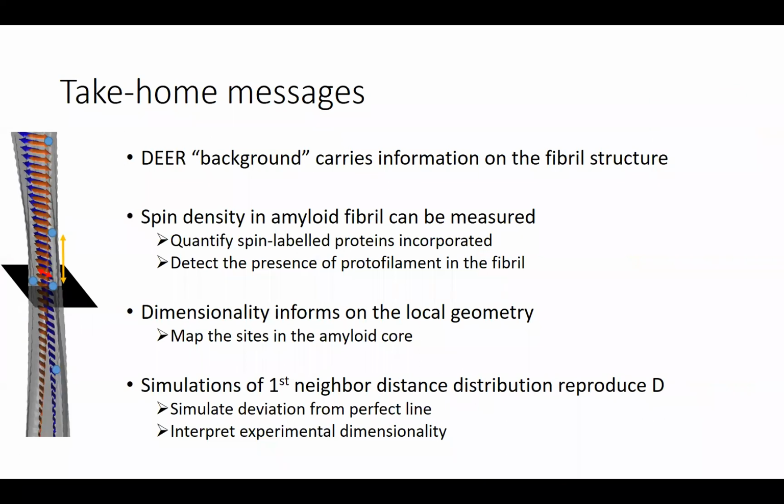Hi, yeah. Hey, Tufa. My question was, so the 1.5 dimensionality, of course, you probably would expect a question on that. I was thinking that it may have been a mixture. I thought it was very interesting, by the way, but I thought it might be a mixture of a 1D matrix with a 3D matrix, right? But I'm guessing at the start, you were showing that you were doing spin dilution, and you didn't find a difference, but maybe you would need to dilute even further, like 1 to 100 or something like that. Did you consider that concentration effect?